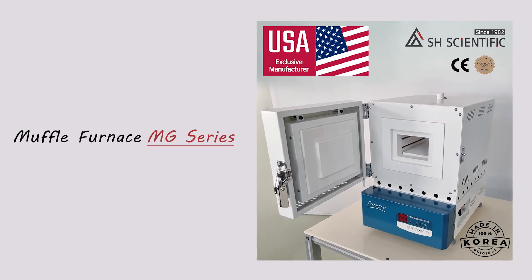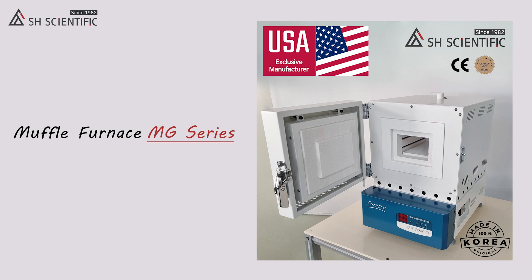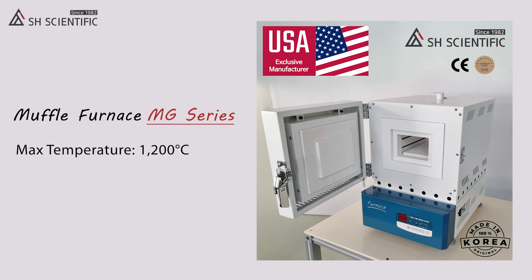Today I'm excited to introduce our MG series, which is the next tier of our basic MGE series of muffle furnaces. The MG is our most universally used line and it operates at temperatures up to 1200 degrees Celsius.